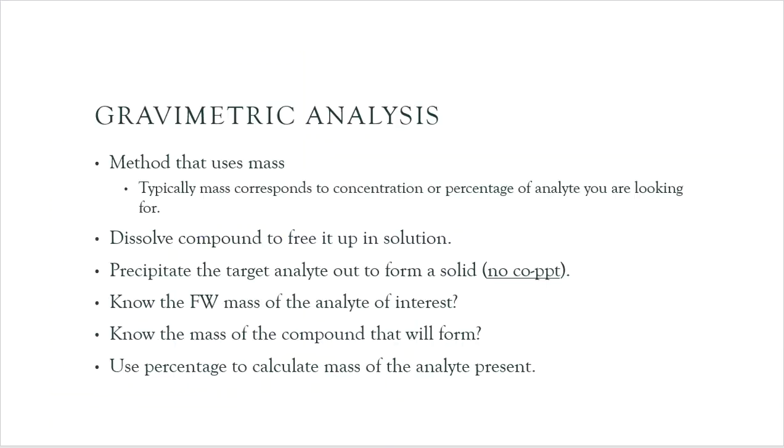So a little bit more detail about gravimetric analysis. Before we go further in talking about nickel DMG, what is it about gravimetric analysis that you need to know walking away from this experiment and this experience that you're getting ready to set a foot on, a journey with me, your lab partner? Okay, well, gravimetric analysis basically is a method that uses mass.